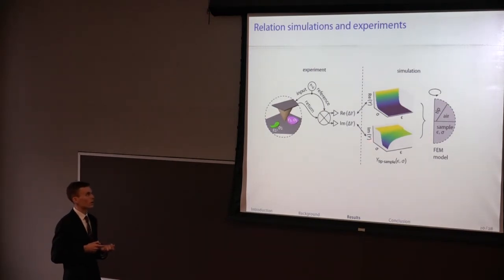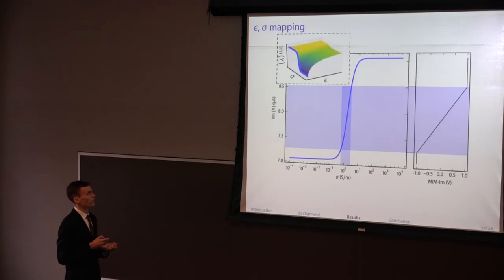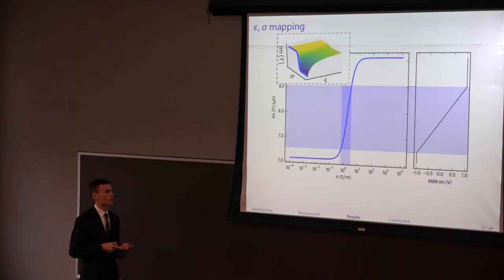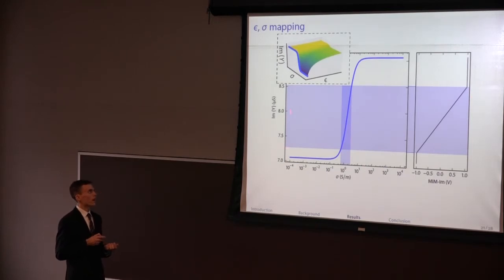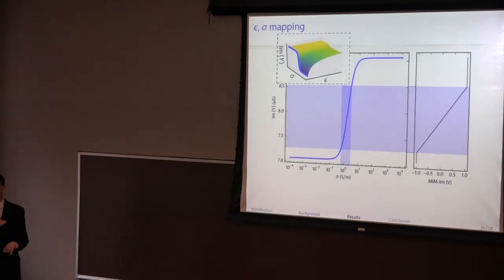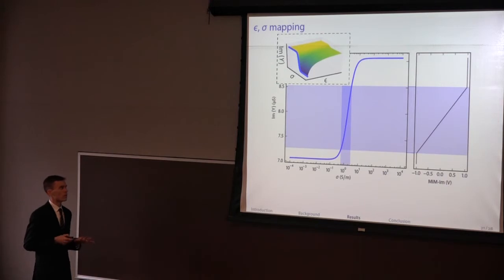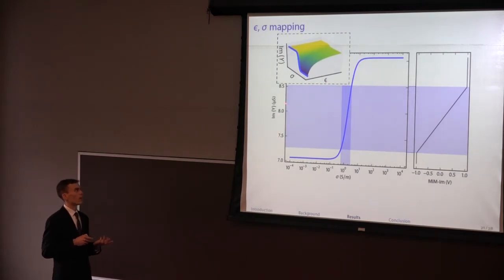Well, if you zero in on this part for a moment, we know that the instrument is giving us something corresponding to admittance, but we don't know exactly where the reference point is. If we pretend that the output of that amplifier is varying between these values of voltage, and assume a nice linear characteristic for the output amplifier, then that's going to get mapped into some range of admittances here, which we could place a reference on by testing samples that have well characterized bulk properties for conductivity and permittivity. And then from our simulations where we've sampled these spaces entirely, we could map that range onto sigma or also epsilon.